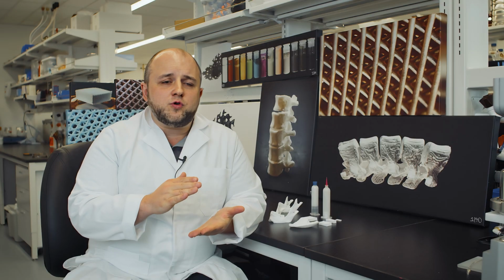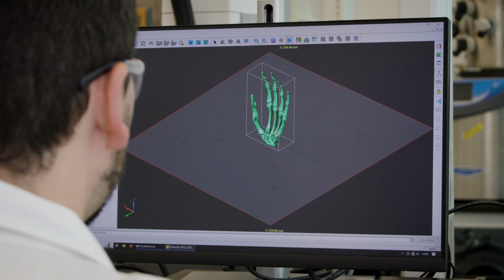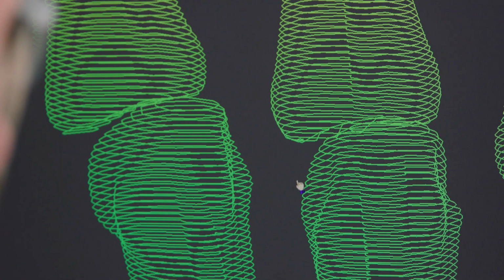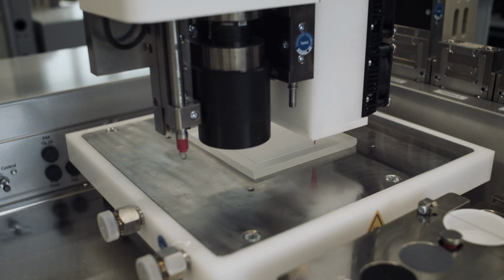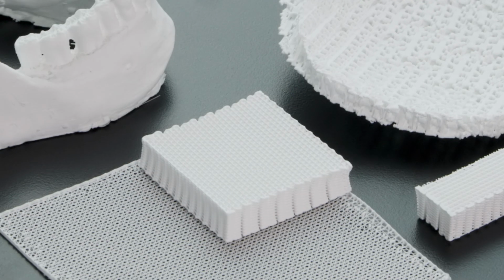We're able to control layer by layer the particular pore structure, pore spacing, fiber diameter, and we're able to do that with ease. On other systems, it might take us days to redesign something. On the Bioplotter software, it only takes us minutes to redesign something and to iterate on it. The 3D Bioplotter also has high print speeds, which is very important for commercial manufacturing. It's fast. We can print CM Flex blocks at a rate that is commercially viable.